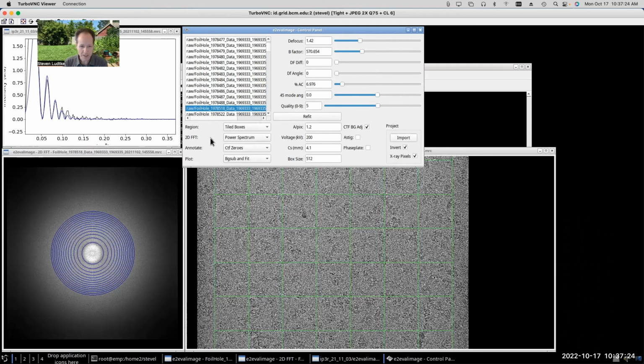We're trying to look at near atomic resolution here. So one of the big factors on most microscopes is stage vibrations. Even if you try to keep the stage perfectly still, if it moves at the level of an atom or two, just a few angstroms, that's going to come through in the imaging.